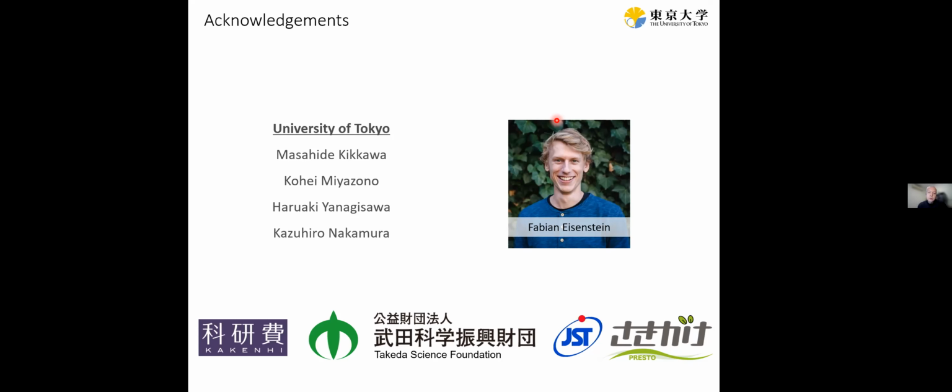The other possibility is to screen a few different detergents and see if anything makes the particles stick less to the air-water interface. I don't know why the receptor-only structures tend to have this issue. In general, smaller particles tend to have more preferential orientation issues, probably related to their fluid dynamics and how often they bounce off the surface, so basically how many times they hit the surface before the grid is frozen. Just try either tilting the grid or several detergents, maybe in addition to the detergent that was used to solubilize the particles, add a little bit of a different detergent or a polymer like PEG or something. I don't know. Okay. Yeah, we'll have a try. Thank you very much.